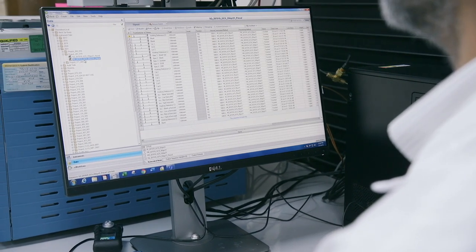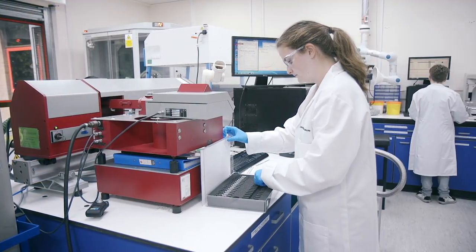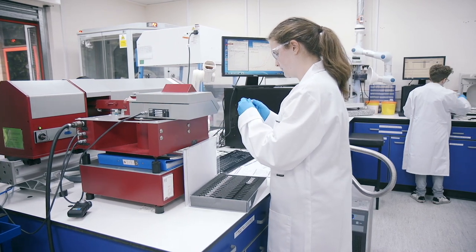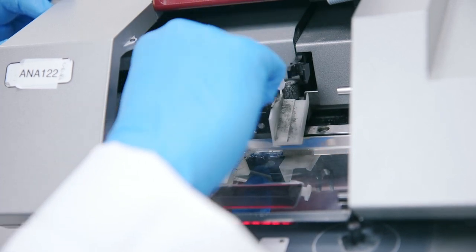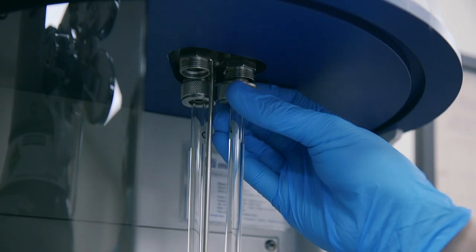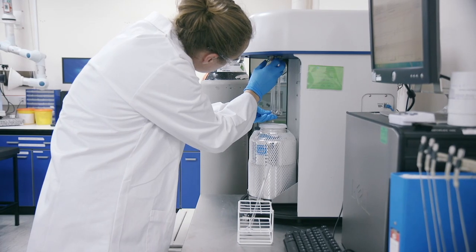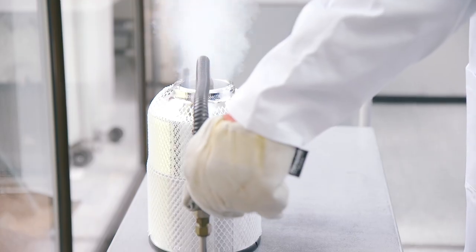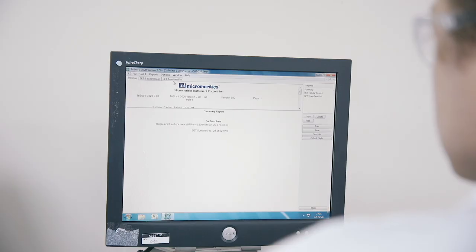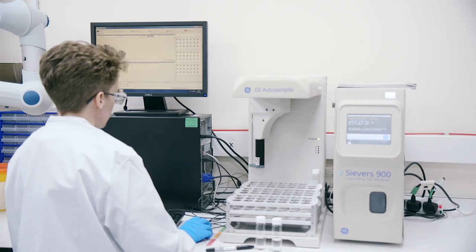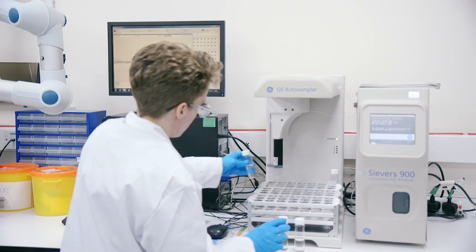The instruments here in our solid-state lab measure a range of physical parameters and powder properties. For example, we measure particle size using the Sympatec HELOS-RODOS Vario, specific surface area using our two Micromeritics TriStar instruments, thermal analysis using DSC and TGA for melting point, glass transition, degradation temperatures and volatiles content, and carbon content using our TOC analyzer, the Sievers 900.